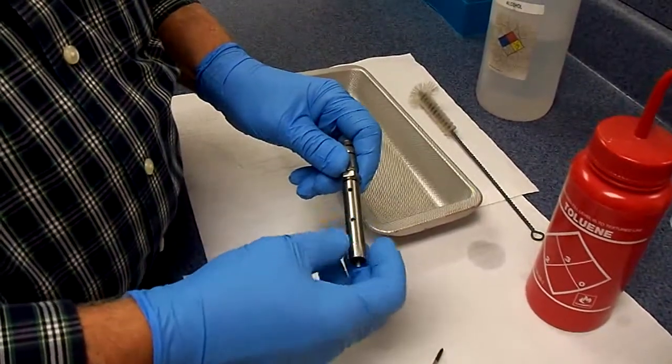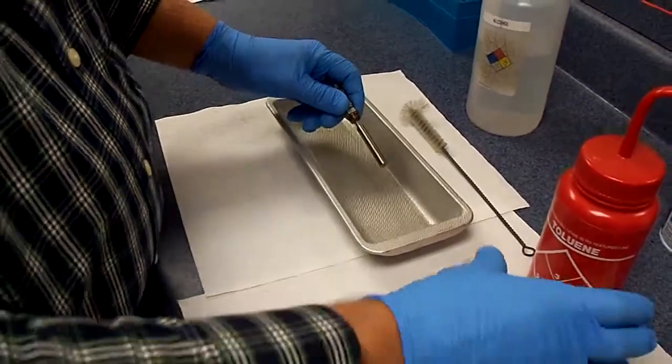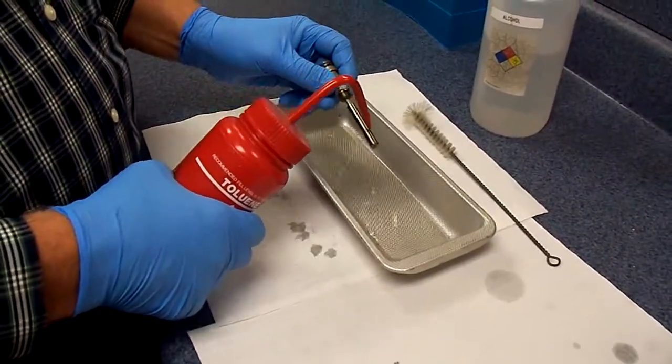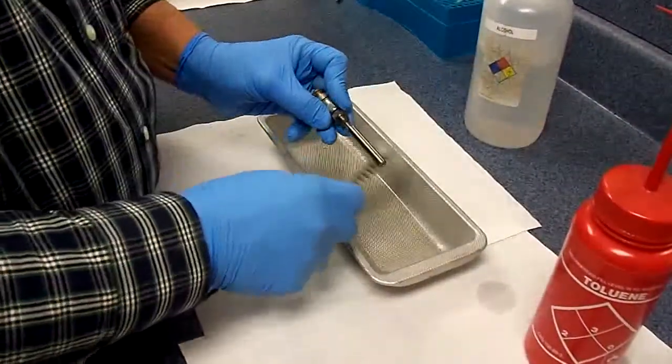Unscrew the outer electrode. Rinse with toluene. Scrub it a little bit.